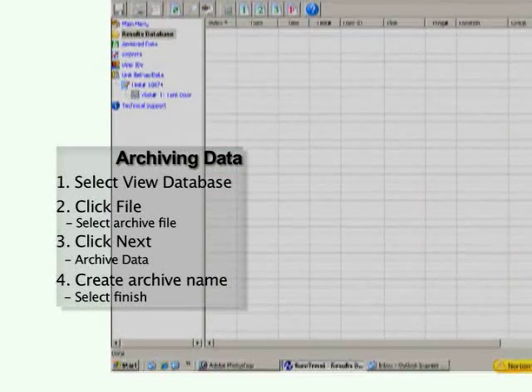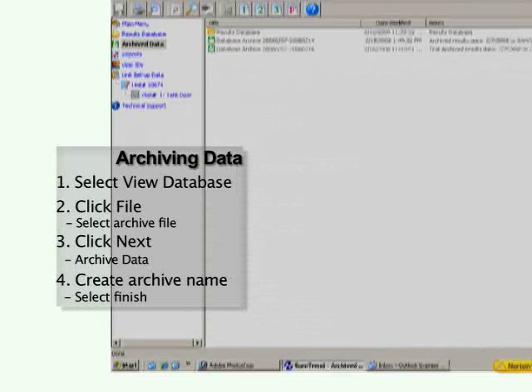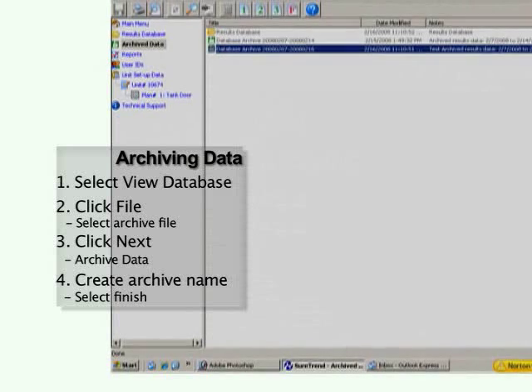To view the data you just archived, click the Archive Data emblem on the left-hand side of the screen and click on the name in which you titled the data.